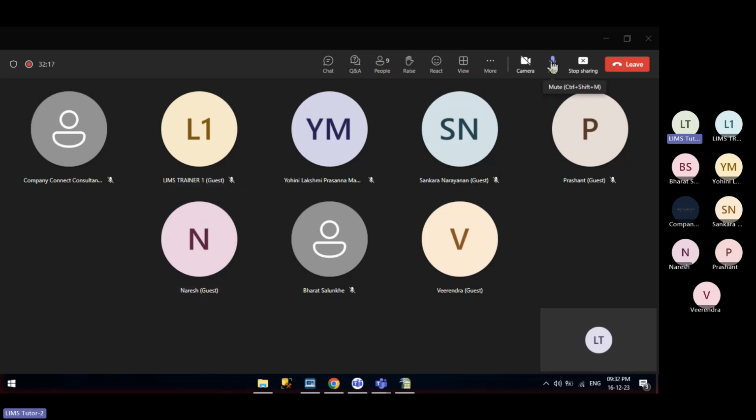So yes, we will install completely online, live, and not just see the presentation. It covers all the things you need for installation. The installation module will start with the prerequisites. The prerequisites will cover which servers are required, what the basic configuration on these servers is, and which basic software should be available first. That clarity will be provided first, and then we will start with the installation steps.